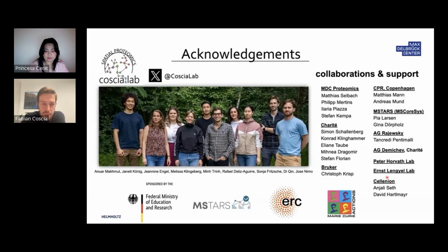the way you design the study, right? So you can look at patient outcomes, so you would know exactly, up to 20 years later, how the patient responded to the therapy, and then use this to design your specific biomedical research study. So in a nutshell, yes, qualitatively they are less good compared to fresh frozen, but we know the proteome is preserved, and using these FFPE samples, we can, in a very powerful manner, design retrospective studies to look at different disease outcomes and trajectories, and connect the clinical data with the molecular protein-centered data.